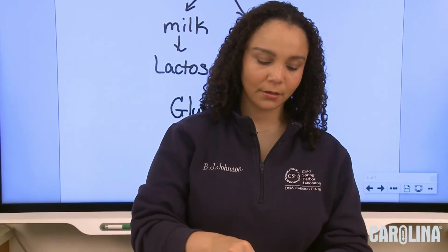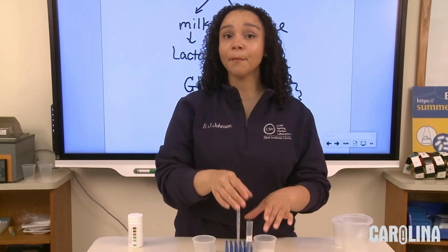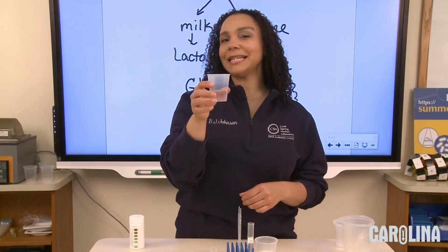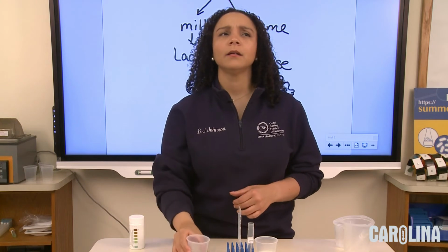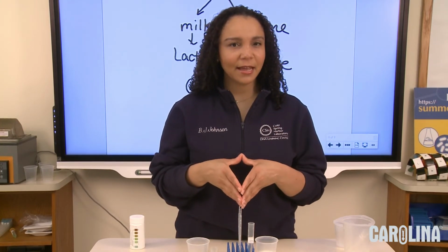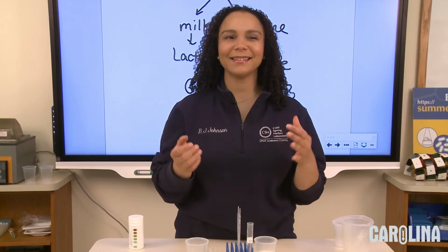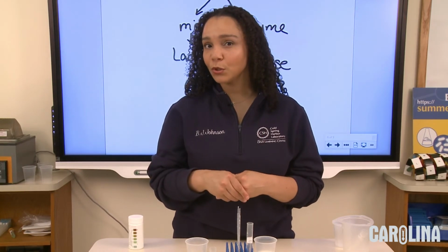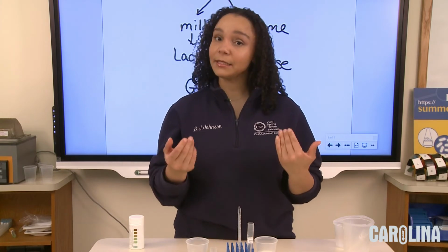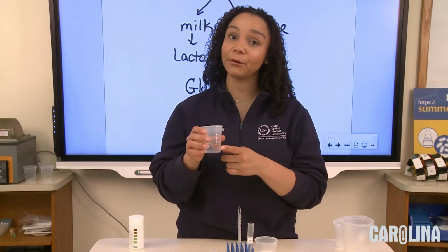Now, how am I going to get the lactase spheres? I'm going to take my sodium alginate lactase mixture and drop it into calcium chloride. You know how when a blizzard is going on and they're trying to prepare the roads, they sprinkle salt on the roads? Well, that salt is calcium chloride. This is just in a liquid form.